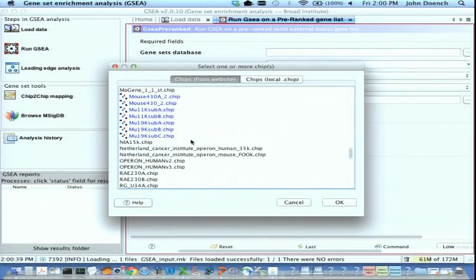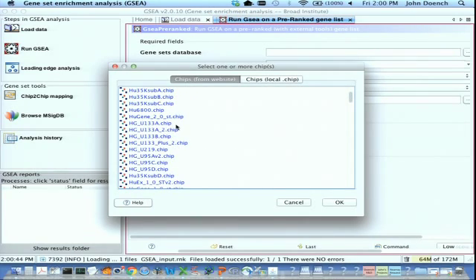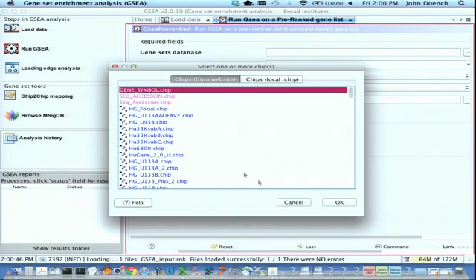There's a whole bunch of others down here. And as you scroll through them, you can see that a lot of them are based on, again, Affymetrix data. But we want to use the gene symbol. Should also point out, this is important, this is all assuming you're human.